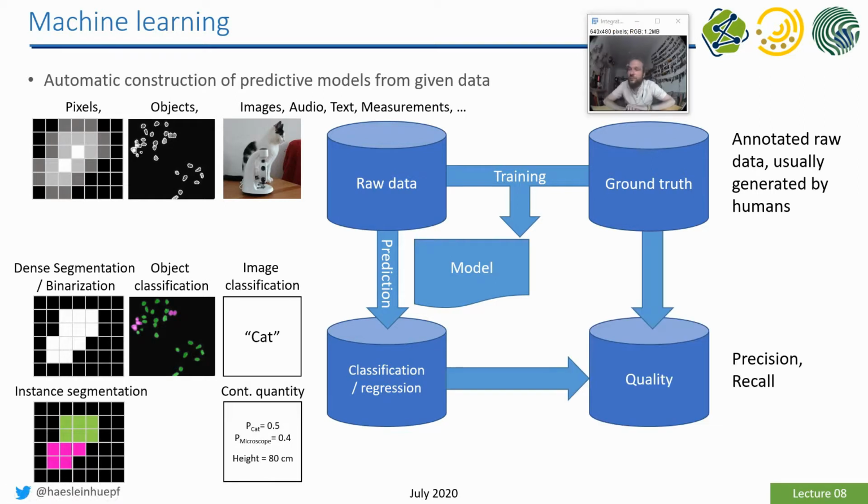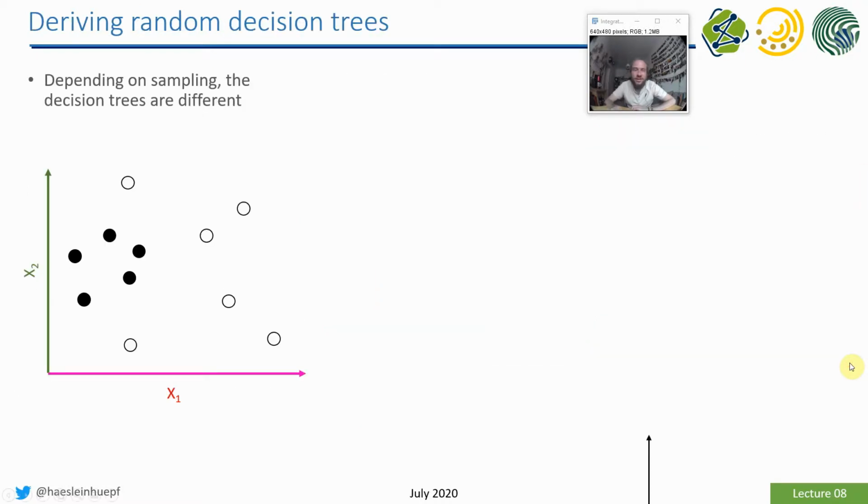And there, quality measurements also play a big role. This is not specific to machine learning. We should measure the quality of all our image segmentation algorithms, or the results of these algorithms. But here it plays a particular role, because it was not us explicitly defining a workflow and doing a measurement. It was the algorithm, the machine learning, the computer, that determined a way of finding a good segmentation. We have to make sure that the algorithm is not misinterpreting parts of the images, and we can do that by quality assurance.